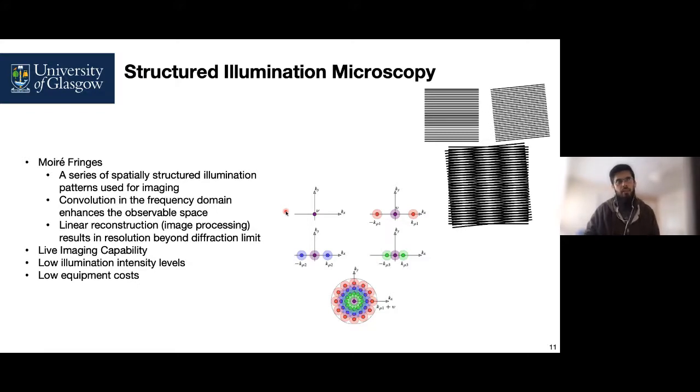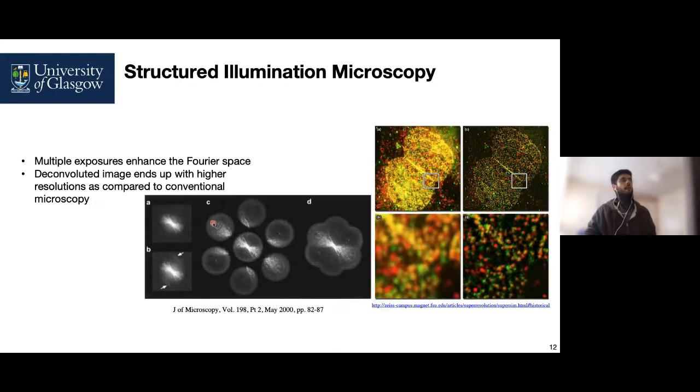Another advantage of structured illumination microscopy is that it doesn't require much equipment, and most of the enhancement can actually be obtained while post-processing. Now, these are basically some demonstrations of structured illumination microscopy.